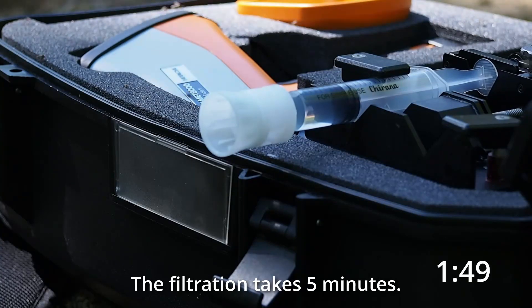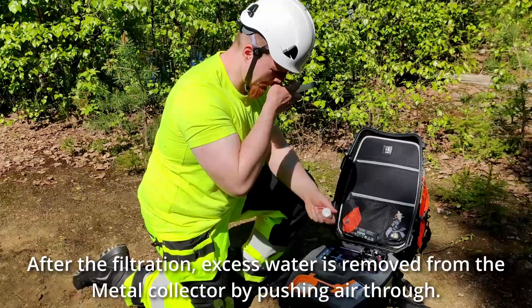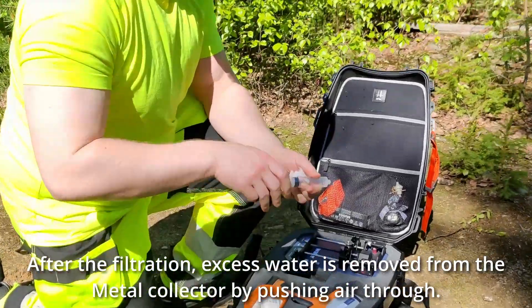The filtration takes 5 minutes. After the filtration, excess water is removed from the metal collector by pushing air through.